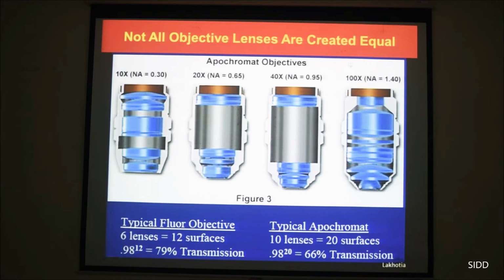And then these are apochromat objectives. Again, apochromat objective, plan apochromat are the best. An apochromat objective may have spherical aberration. Plan apochromat will not have spherical or chromatic aberration. And obviously they are extremely expensive. I can just tell you that a 63x apochromat objective, oil immersion objective, plan apochromat can cost more than 1 lakh rupees. And so be extremely careful about these, that if they are damaged, they can't be repaired.